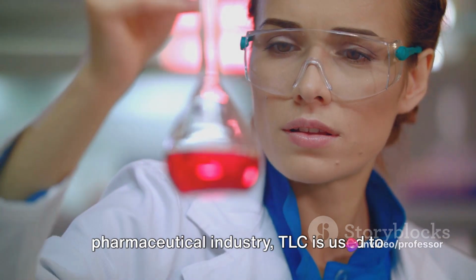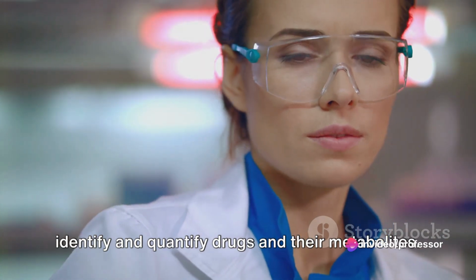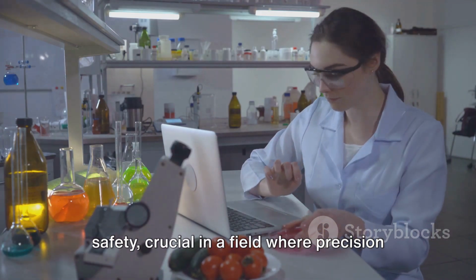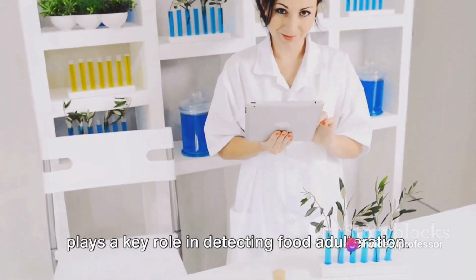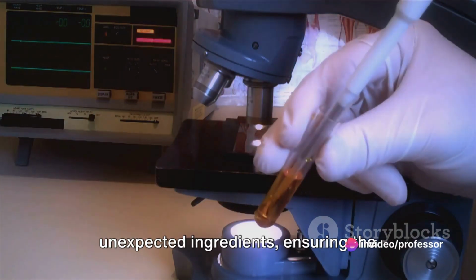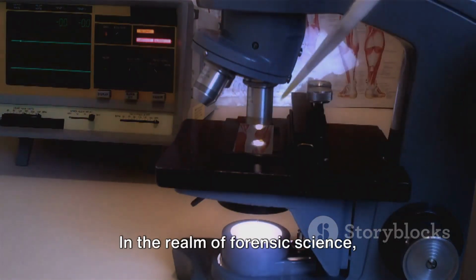In the pharmaceutical industry, TLC is used to identify and quantify drugs and their metabolites. It helps ensure product integrity and safety, crucial in a field where precision is vital. Moving over to the food industry, it plays a key role in detecting food adulteration. It helps identify harmful substances or unexpected ingredients, ensuring the quality and safety of our daily meals.